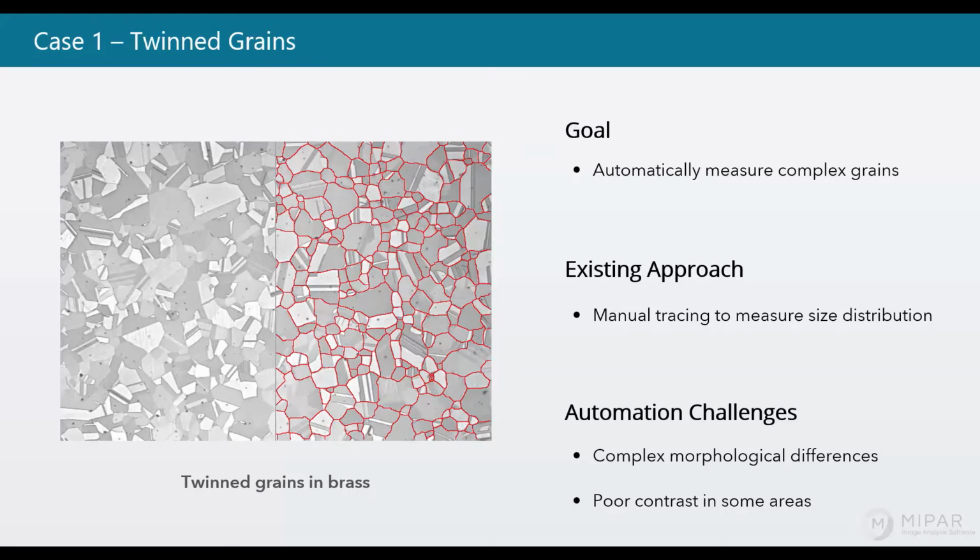You've got just a very strong dependence on local pattern difference that tells your brain when to move from one grain to another. If you've had experience in looking at this type of microstructure, you can recognize the grain boundaries, but you've got to do some mental gymnastics behind the scenes and piece together a lot of these striped features into a typical grain shape before your brain recognizes, aha, that's an entire grain right there. And we've tried all kinds of approaches prior to deep learning, never came close to getting the software to do what our brains are doing.